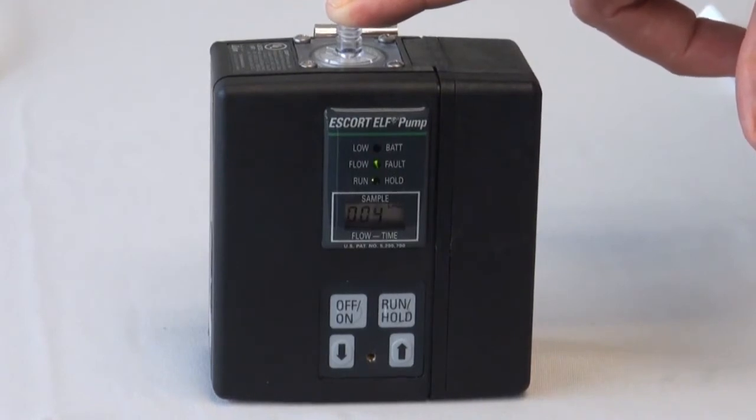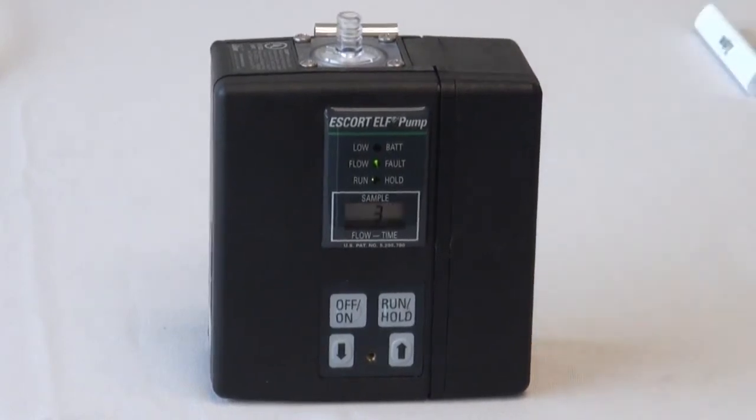If the flow rate does not drop to this rate, check the inlet filter cover for cracks or an incorrect O-ring assembly. Make any necessary maintenance changes. Leave the pump at 2.5 liters per minute and turn the pump off.